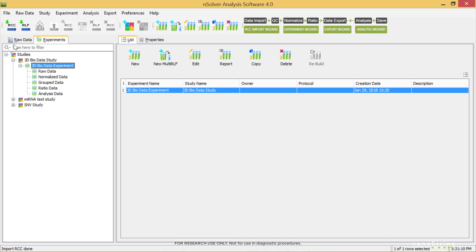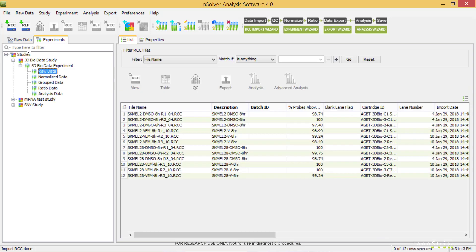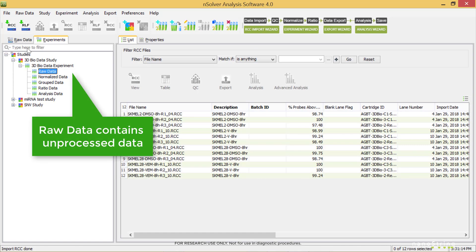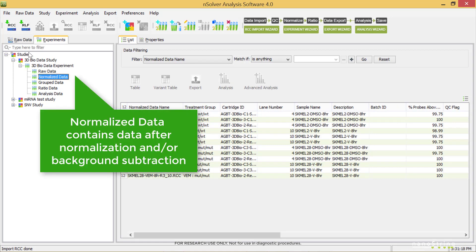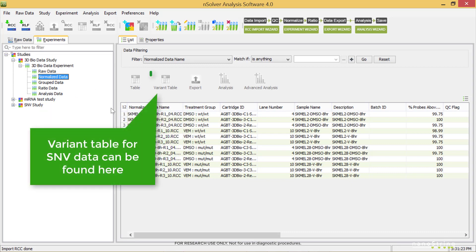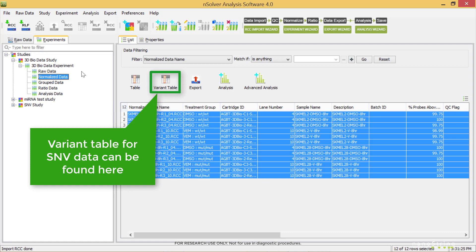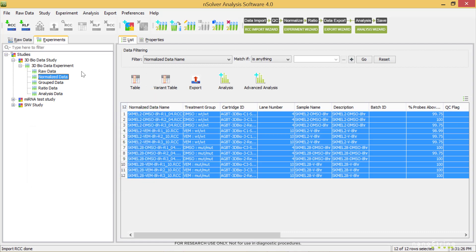Here, we'll discuss what levels of data you'll find here. The raw data contains unprocessed data. The normalized data contains data after normalization and background correction had been applied. As a side note, the variant table for SNV data can be found under this level.